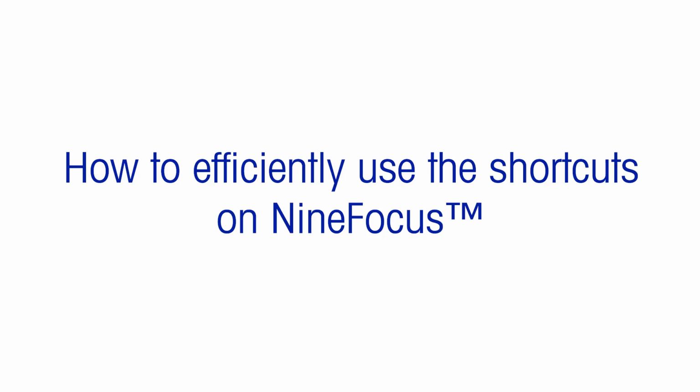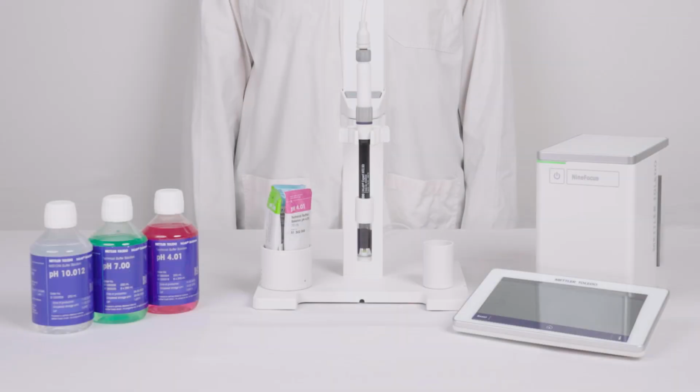How to efficiently use the shortcuts on NineFocus. Welcome to this shortcuts video.